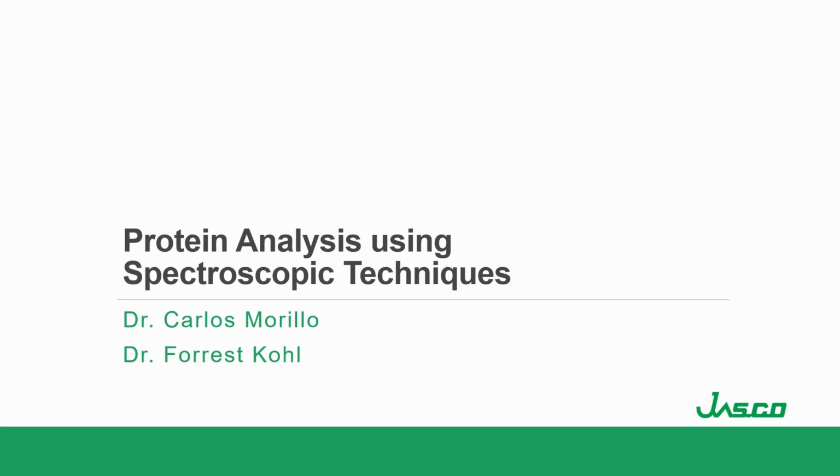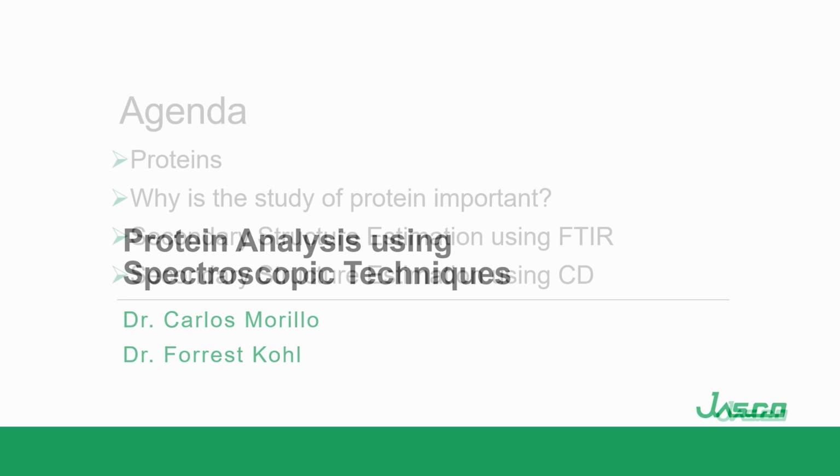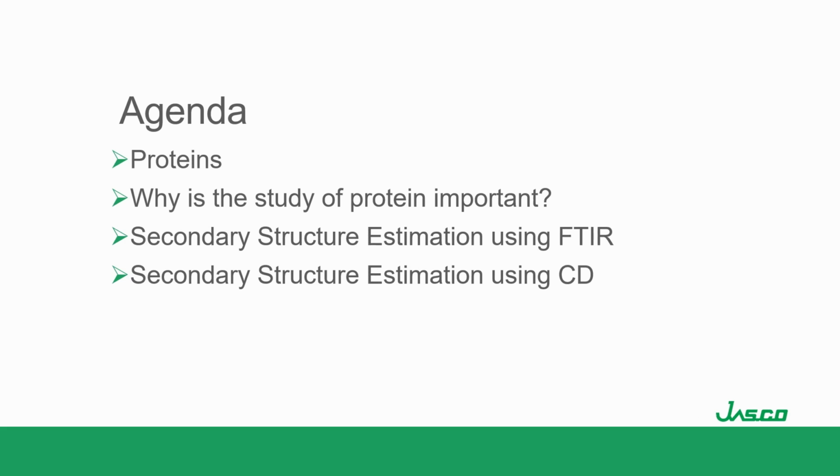So today we are going to be talking about protein analysis using a couple of spectroscopy techniques. The agenda for today is: we are going to be talking about proteins, why it is important to study proteins, and also secondary structure estimation using FTIR and using circular dichroism.